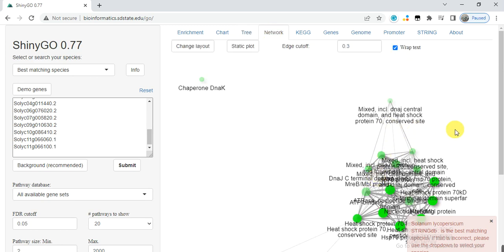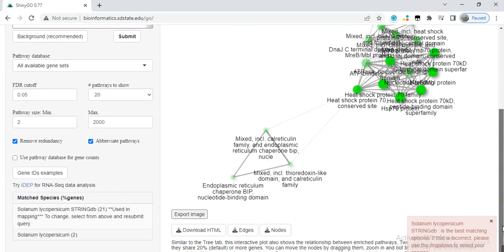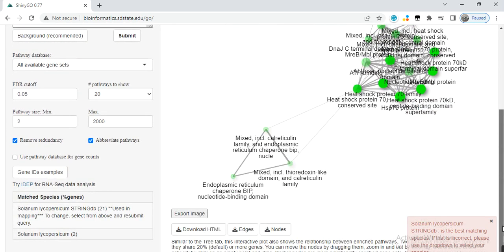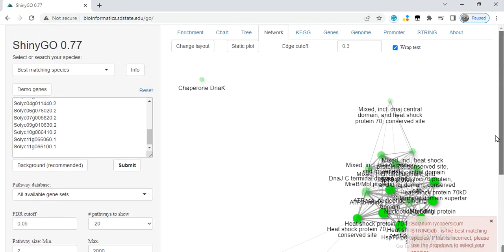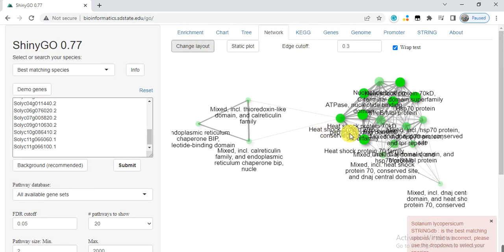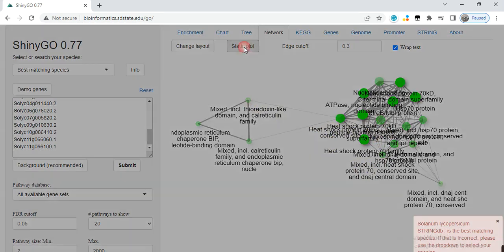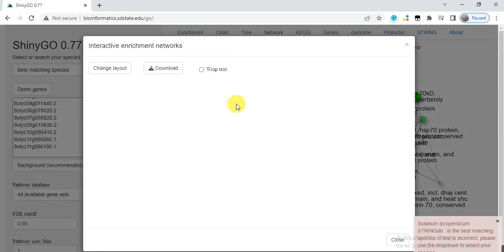The third one gives you the protein-protein interaction network of our genes. From here you can change the layout—which layout you want—and static plot.